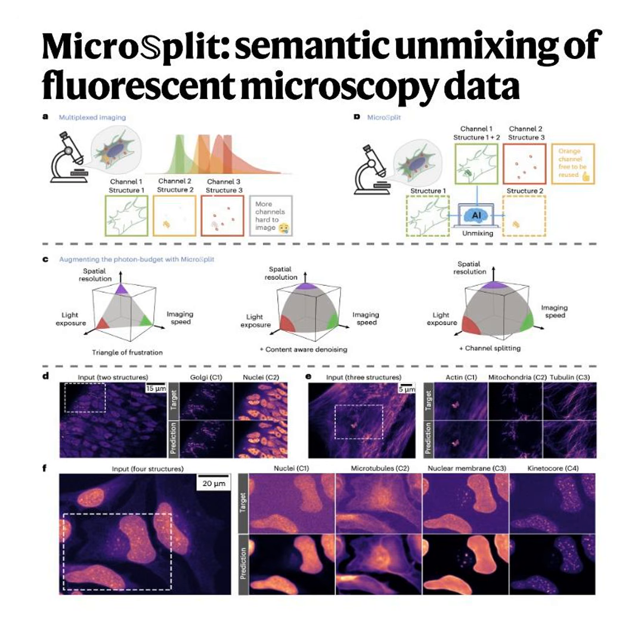But right now, I need to push back a little bit on this MicroSplit thing. Okay, let's hear it. If we are throwing up to 4 completely different structures into one single visual bucket, isn't the AI just looking at a giant, muddy, overexposed blob? Well, it looks like a blob to us, sure. So how does the AI actually know what it's looking at without just hallucinating the data? I mean, AI hallucinations are a massive problem.